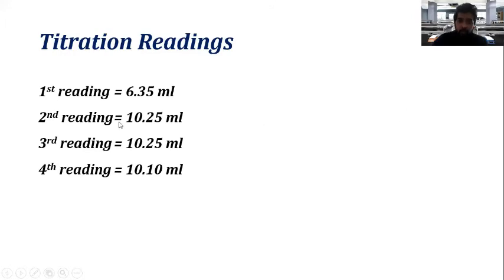Okay, so we have to calculate the acid value separately for these three readings, and at the end we can take the average acid value. So that's the proper practice.